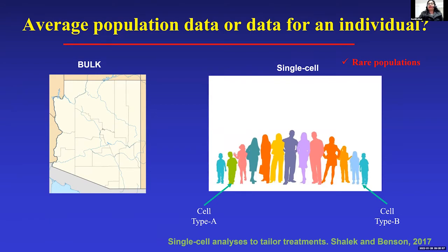And there have been many known publications recently which have claimed to discover new populations and subtypes of dendritic cells, macrophages, and progenitor cells with the help of single-cell RNA-seq analysis.